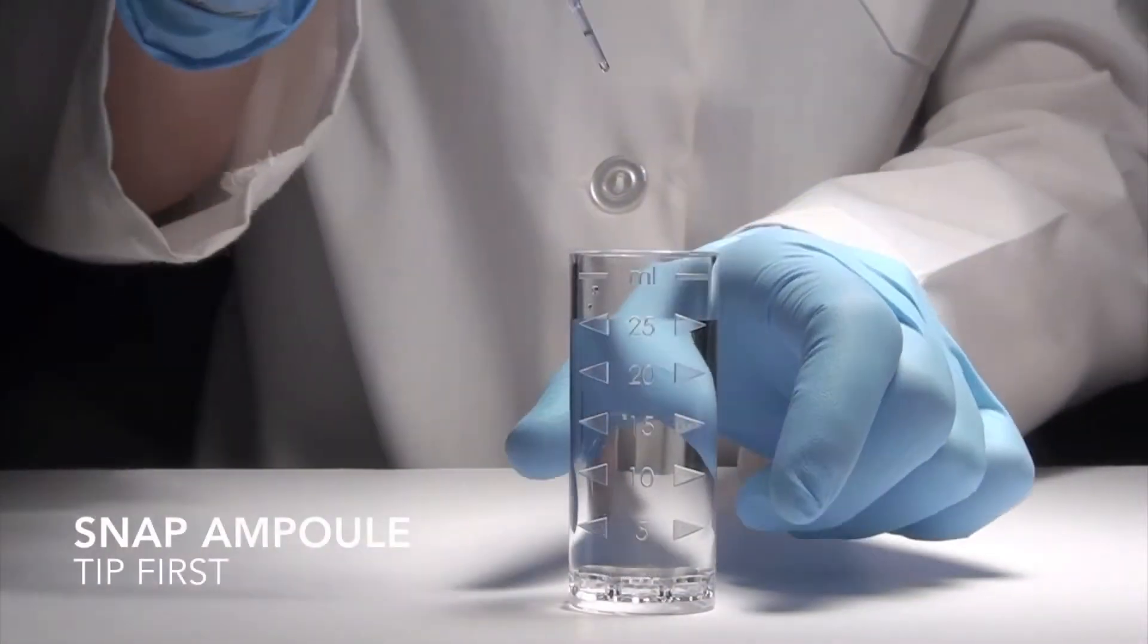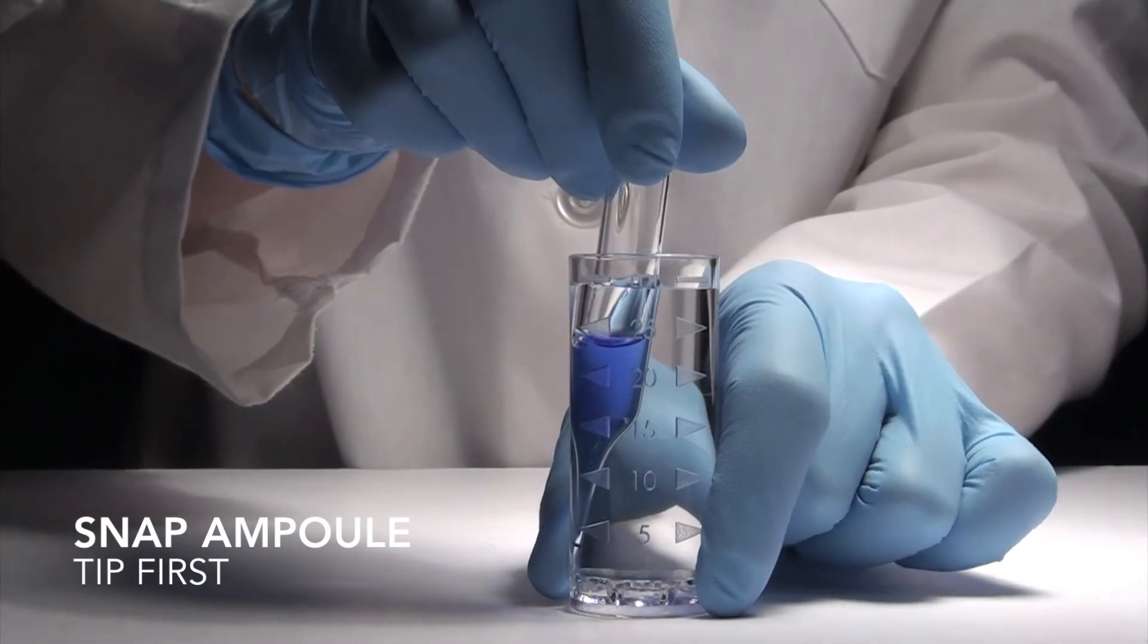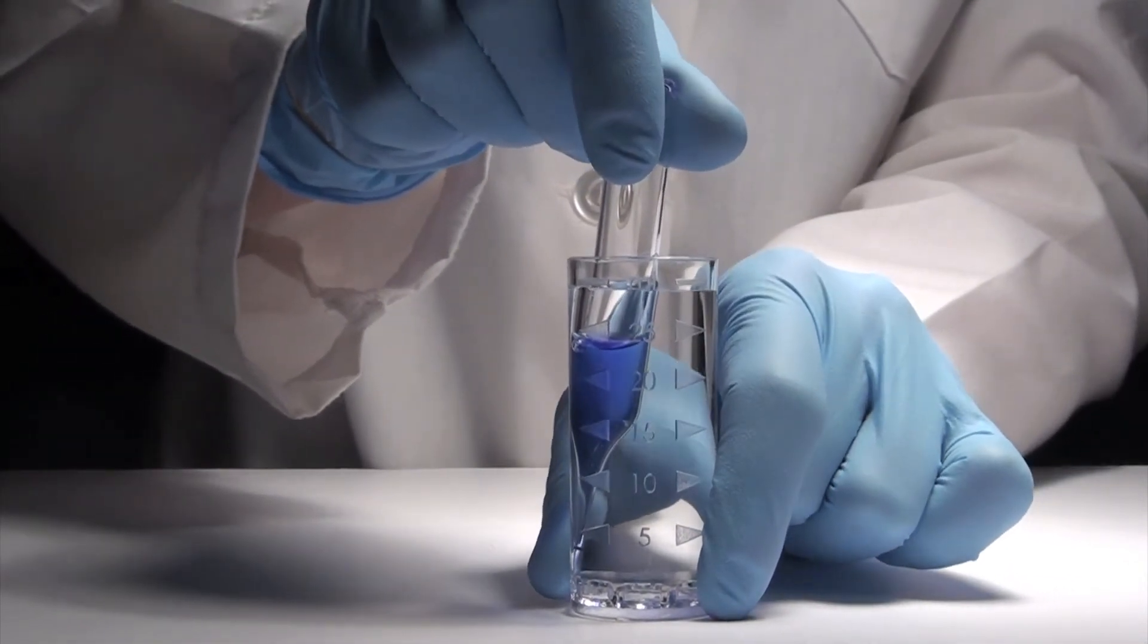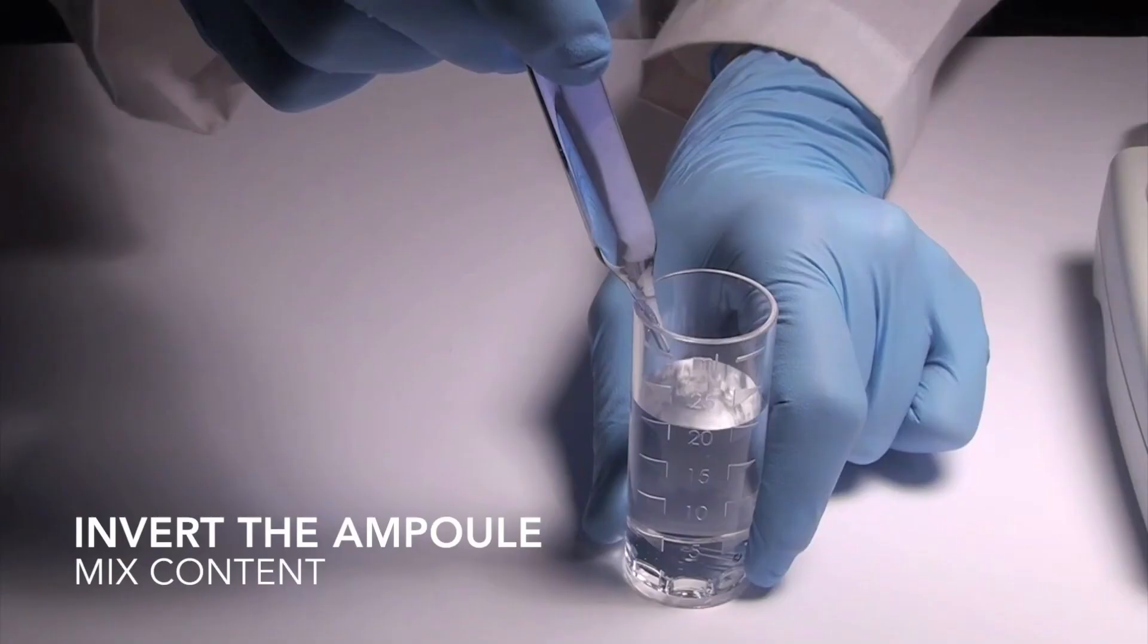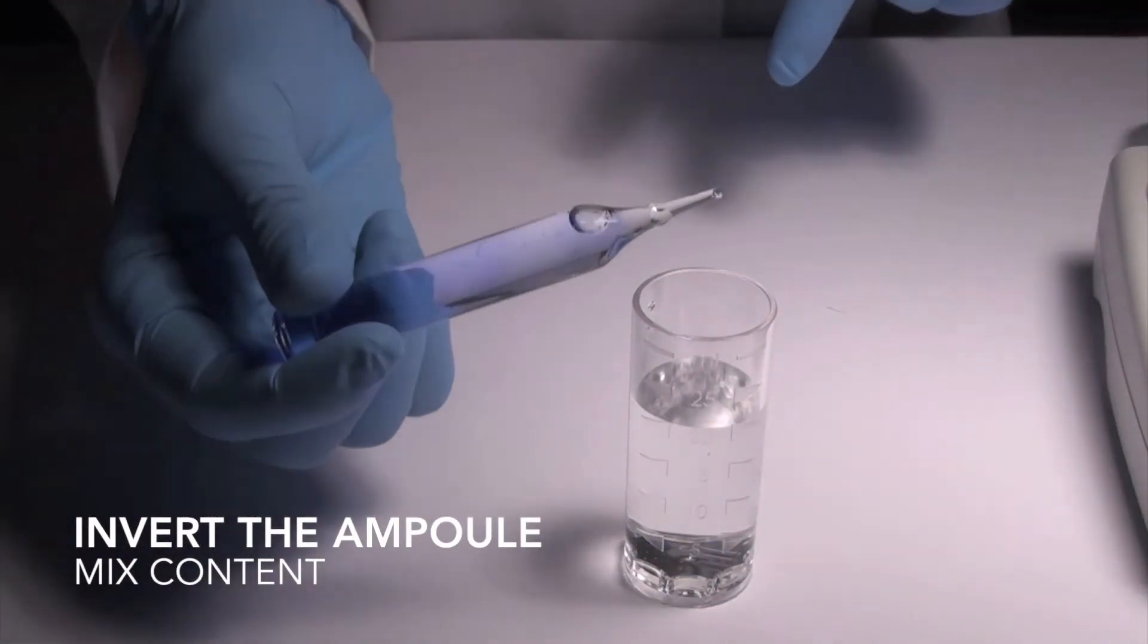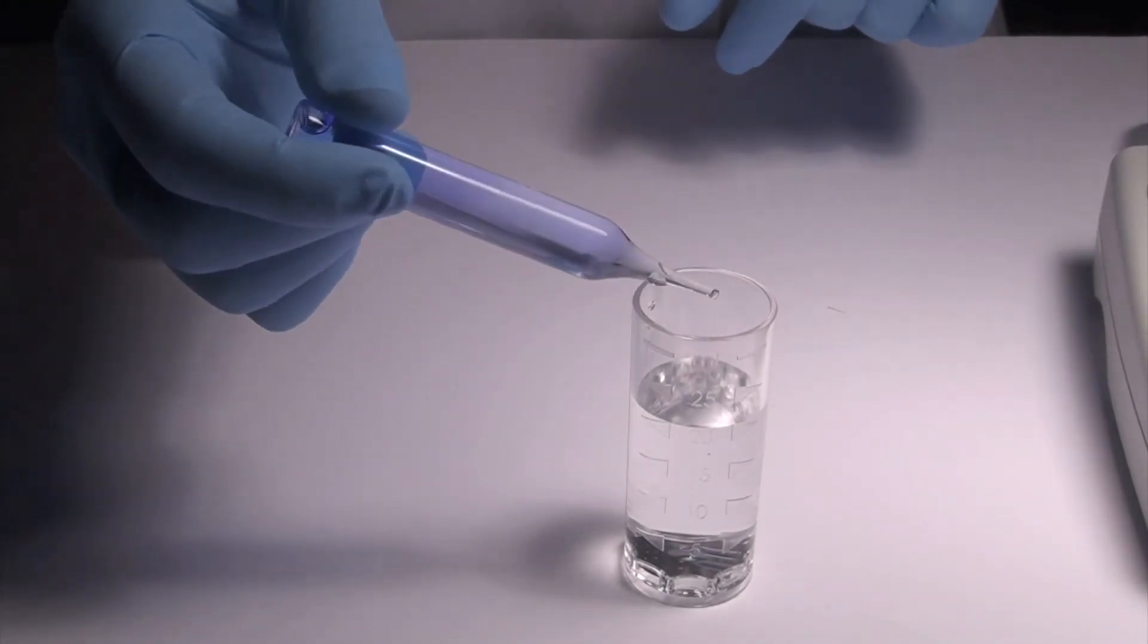Immediately, place the vacuvial ampoule from which the reagent blank value was generated, tip first, into the sample cup. Snap the tip. The ampoule will fill, leaving a bubble for mixing. Gently invert the ampoule continuously for 30 seconds, allowing the bubble to travel from end to end.